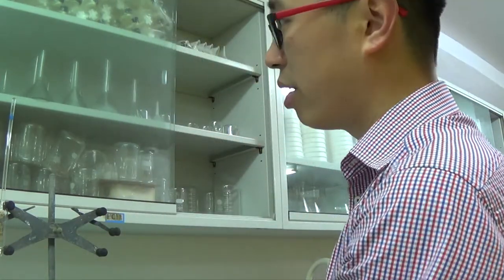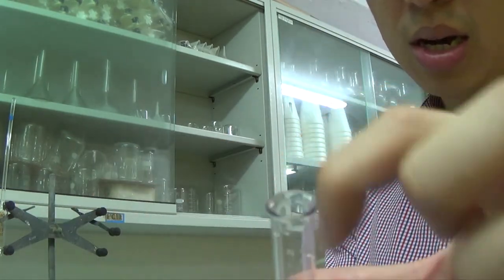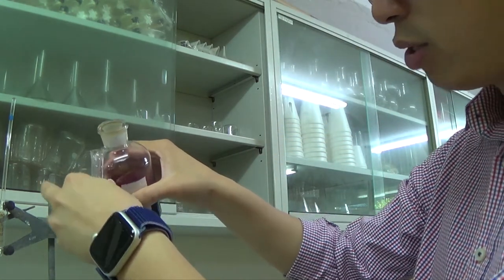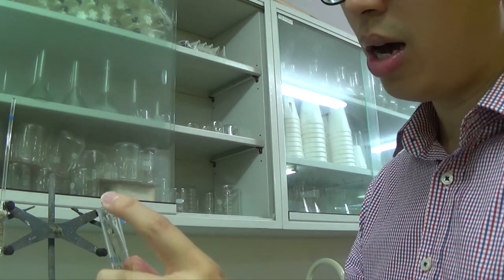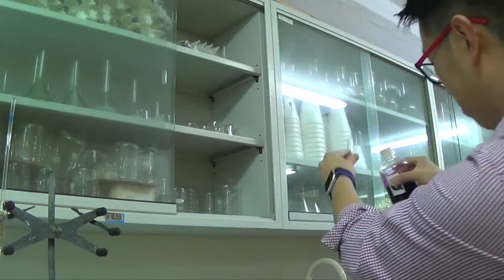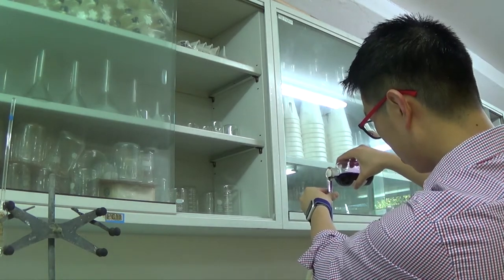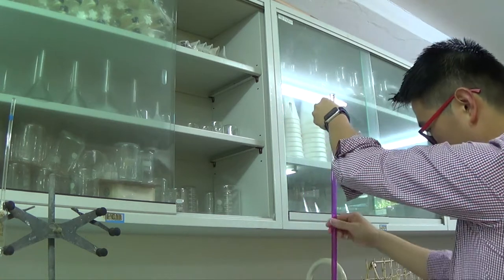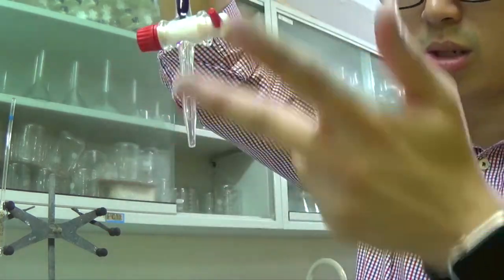Again, in reality, because of the circular nature of this, when you pour it in, there's a risk of you spilling it over. So you should really use a small funnel in order to transfer the liquid into the burette. Okay, I'll do this at the sink because I'm worried about spilling it. So very, very dark purple. The tap is closed. It doesn't spill at the bottom.